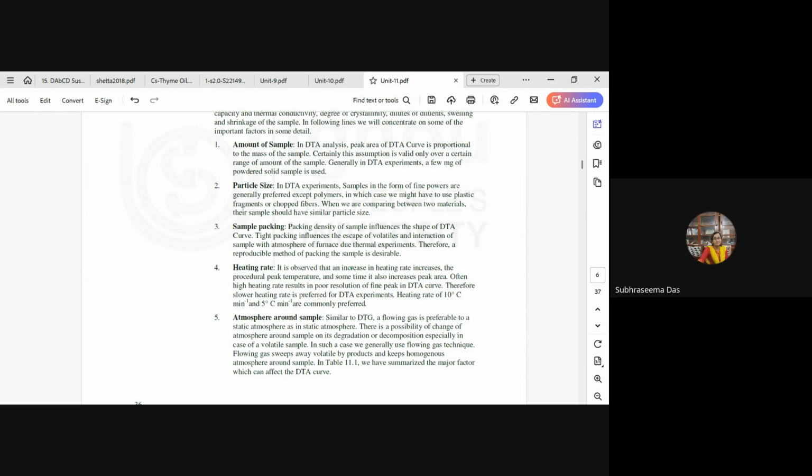Okay. That is why it is named STA, all three, DSC, TGA and DTA. Yes. You can measure the TGA, the DSC, and from the plot, it will also give you the DTG plots, the DTA plots, and everything. It is called STA. We have one in our institute. Is it available anywhere in Odisha, any institute? Yes, it is available in Odisha.